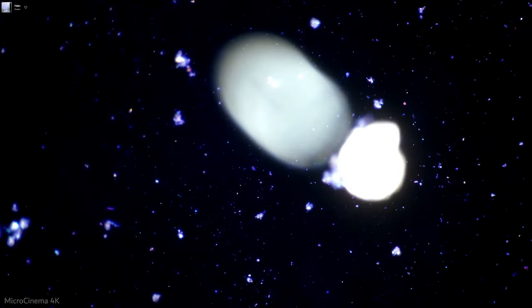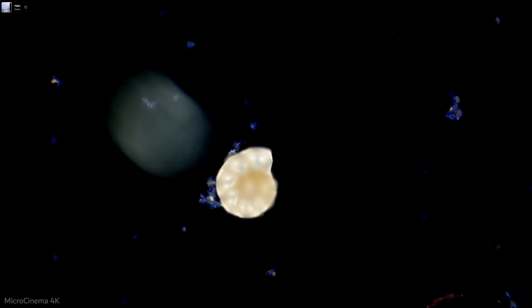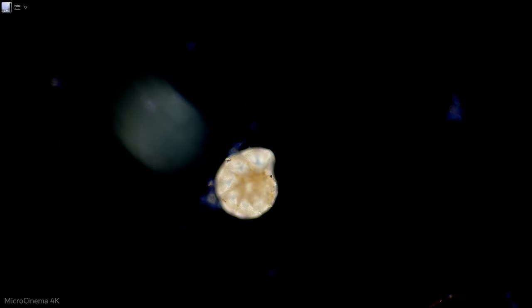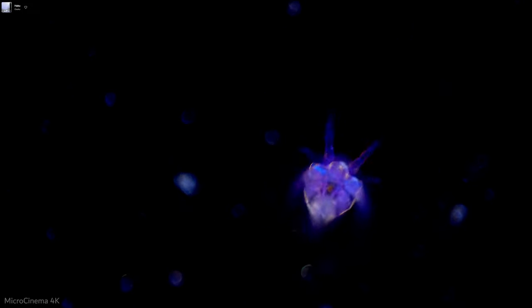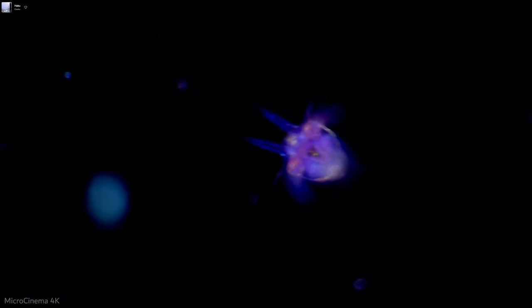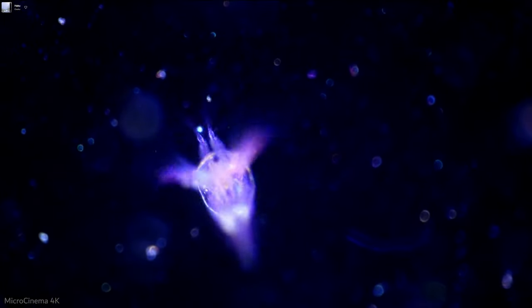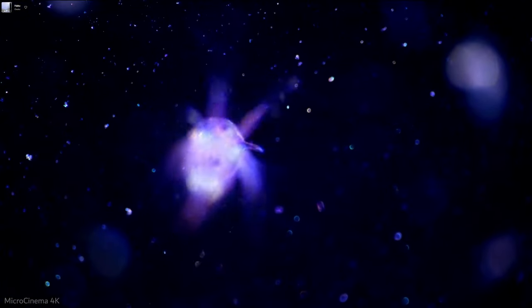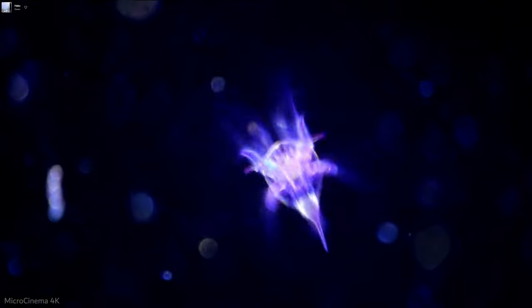Where's our little Foram at? Was that it there? Wow. Yeah, it's still looking so strange. Oh, wow. Really interesting. Yeah, 1 watt LED. Marcus, what microscope do you have again? Sorry, I'm sure I've asked before. It's just hard to keep track of everybody's hardware. Oh yeah, we were just looking at how these little feelers are so thin. We can't really get a full view of them here.